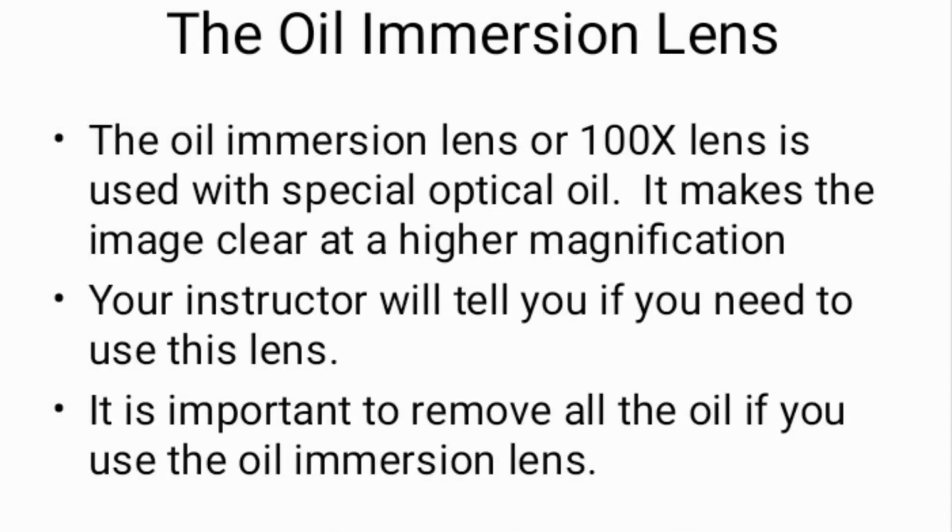Alright, the oil immersion lens. The oil immersion lens, or 100 times lens, is used with special optical oil. It makes the image clear at a higher magnification. Your instructor will tell you if you need to use this lens. It is important to remove all the oil if you use the oil immersion lens.